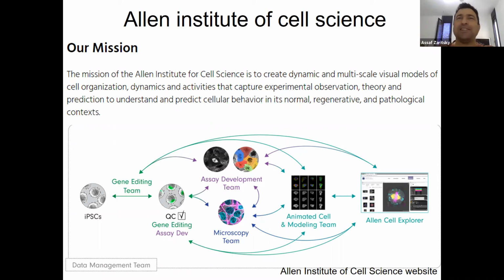So they have a factory-wide setting where they have a farm of microscopes, and they are generating cells with specific organelles fluorescently tagged with the best techniques available. And they give the cells to anyone. So if you want to take their cells, which are also a cool cell system, but I'm not going to talk about it, and image them in your lab, no problem, they'll send it to you. They use this farm of microscopes. They are going to validate these cells much better than any individual lab does.